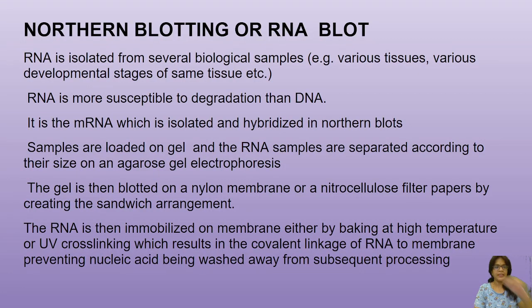The next one is the northern blotting technique. It is also called an RNA blot. RNA is an important genetic material for many viruses also. RNA has more susceptibility to degradation than DNA. RNA samples are loaded on the gel and separated by agarose gel electrophoresis.